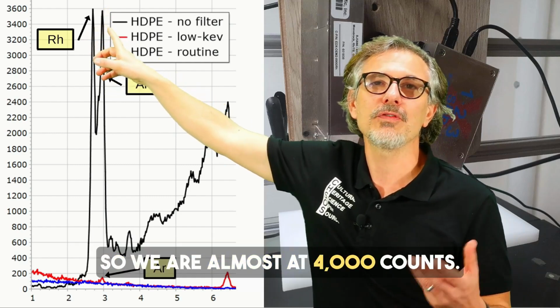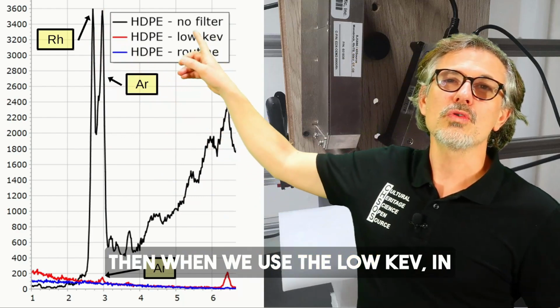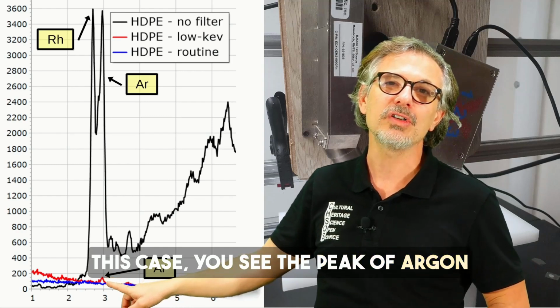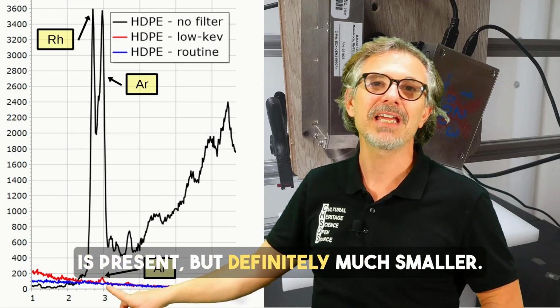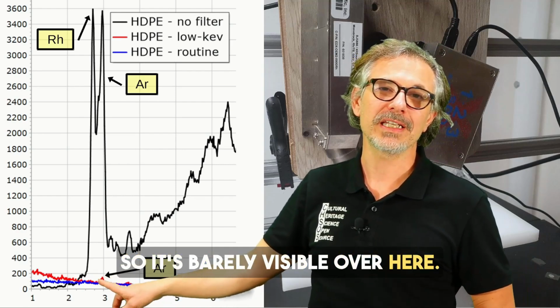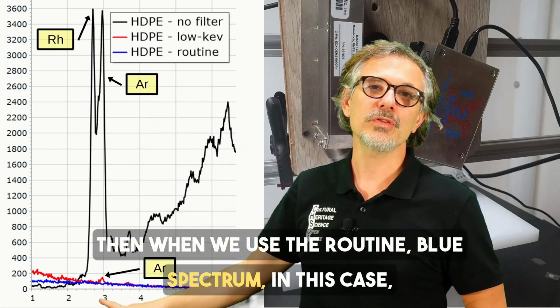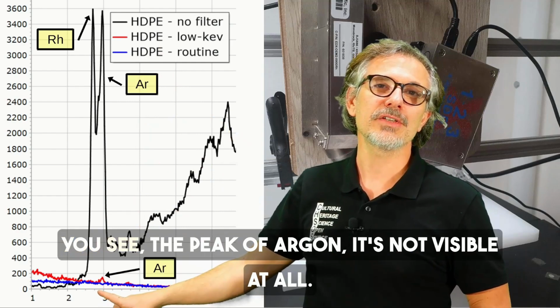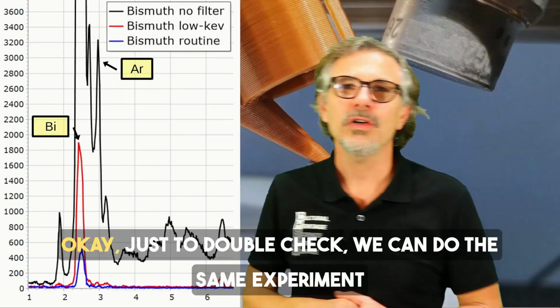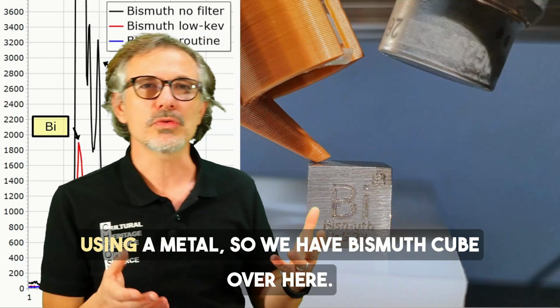so we are almost at 4000 counts. Then when we use the low keV filter setup, you see the peak of argon is present, but definitely much smaller, barely visible over here. Then when we use the routine filter setup, the blue spectrum, you see the peak of argon is not visible at all.